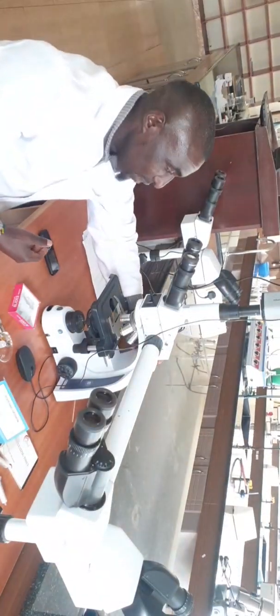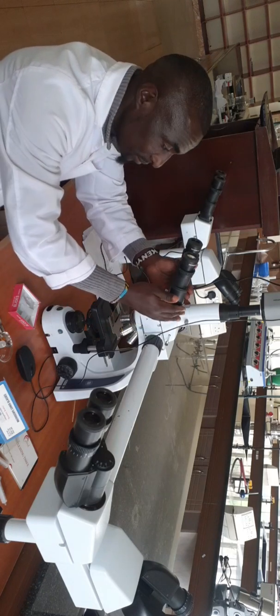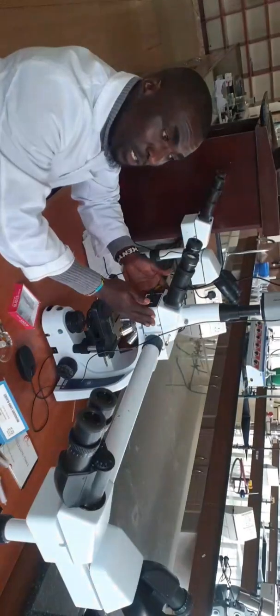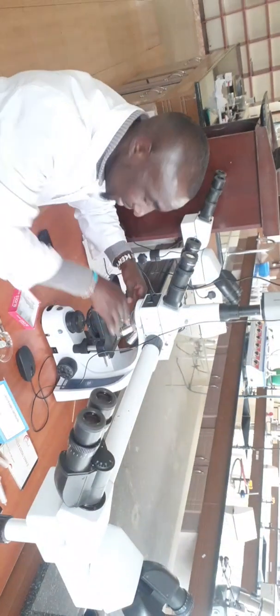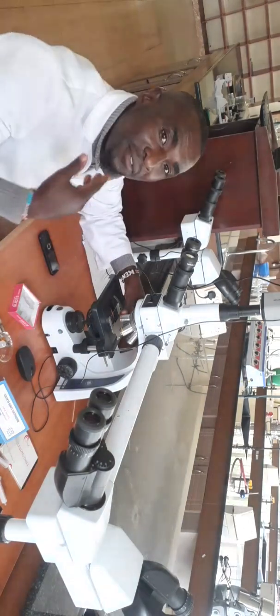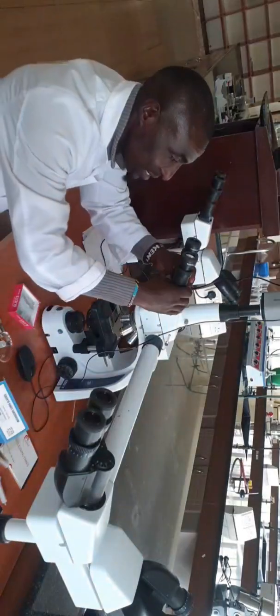Now, we find that the arm is attached to the body tube. This is the body tube. This body tube contains the eyepiece and objective lenses. These are the objective lenses, which are revolving, we call them revolving nose pieces. So they are the objective lenses and this is the eyepiece.